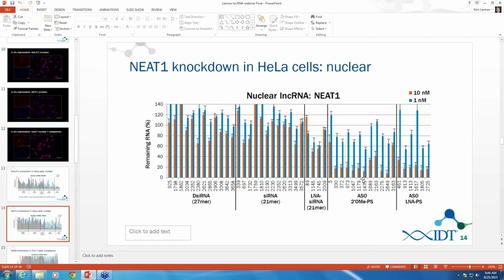So another person was saying that they had used significantly more. They'd used like 50 nanomolar and 100 nanomolar, and they didn't actually see any effect, and they want to know if they should maybe go back and try those lower doses.